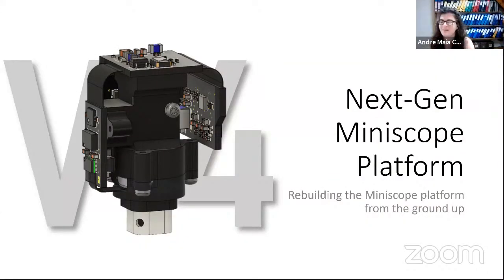A question is coming in: does the GRIN lens implant go in with the virus injection, or should we wait like 2 weeks after the virus expression? That's a good question. People do it differently. The time constraint you have here is that GCaMP viral injection will take somewhere between 2 to 4 weeks for the cells to begin to visually fluoresce. So there's a time course there for expression.